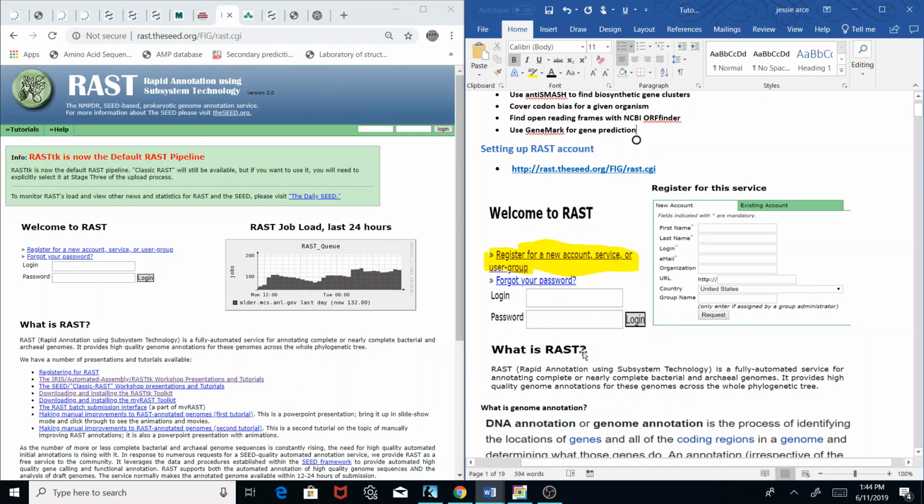I'm not going to show RAST in particular in this tutorial, but I just want you to set up your account first. In future tutorials we will be covering RAST, the web browser based version, and then the IRIS command line environment. We will be using RAST a good portion of the time, or at least in a few tutorials, and you will cover RAST in the homework and in your project or presentations. So it's good to go ahead and get this set up already.